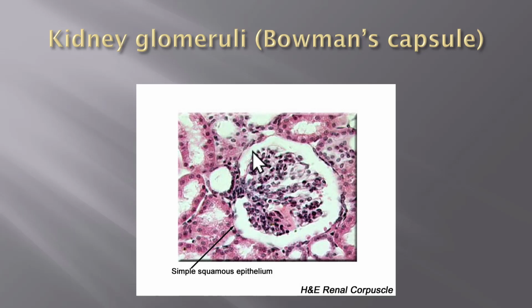So we just said that with an epithelial tissue you have to have a free edge. Well, this is a free edge. This is a free edge. This is a free edge. So you go in from your free edge and you look at the cell. So coming in from my free edge here, I have a single layer. It changes into something else over here.